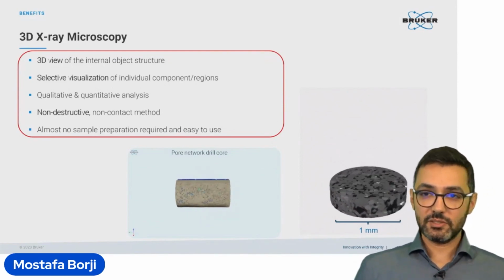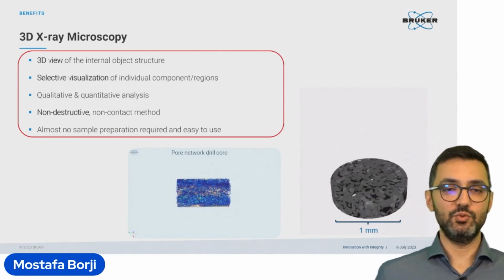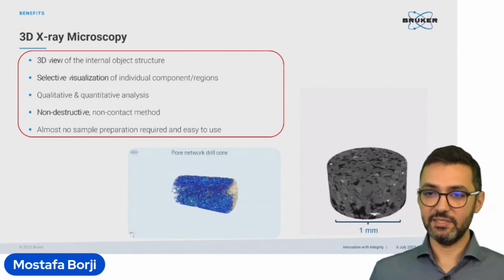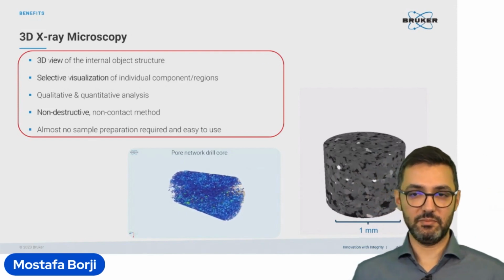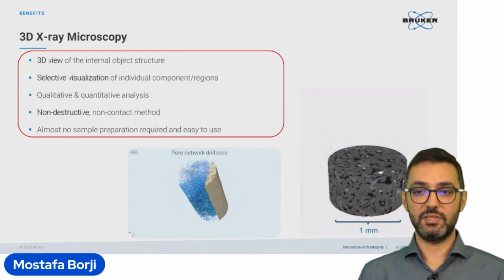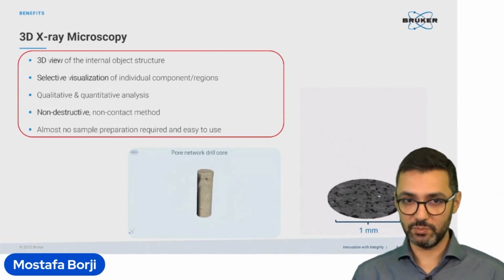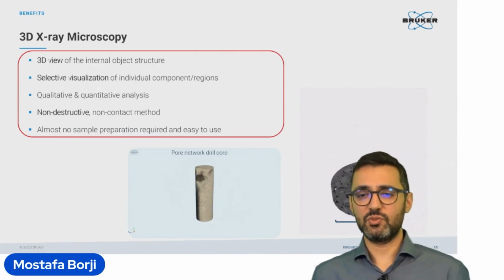Another very important thing is that we almost don't need to do any sample preparation, or at least if we need something, it is quite easy. So I would say this is an easy sample preparation technique that wouldn't be difficult, and it's also very easy to use.